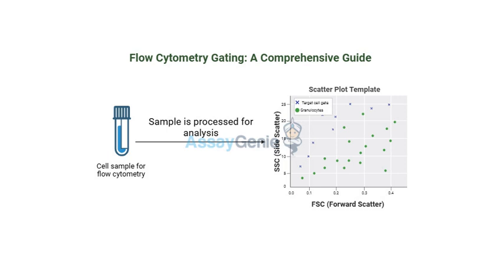And we're back for the last part of our deep dive into flow cytometry gating. It's been a wild ride. We started feeling kind of lost in all that data, but now we can find specific cells, and we've even learned some cool cellular secrets. Yeah, it's really amazing what we can do when we have the right tools and know the right techniques. For sure. And speaking of tools, I've heard about this thing called dimensionality reduction. Sounds kind of sci-fi, but what is it exactly?